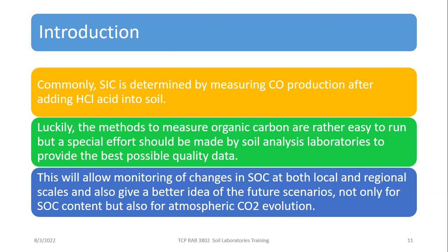There are many methods to measure organic carbon. Most of them are very easy, but a special effort should be made by soil analysis laboratories to provide the best possible quality data. We can talk a little about these methods.